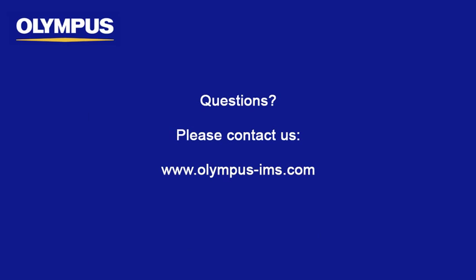In this instructional video, we have covered license activation within the Olympus Stream software.